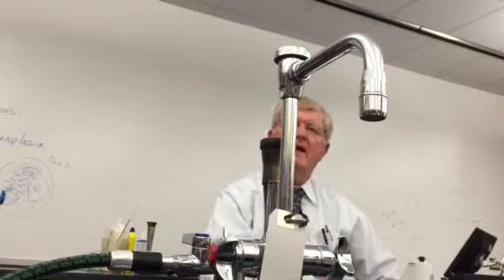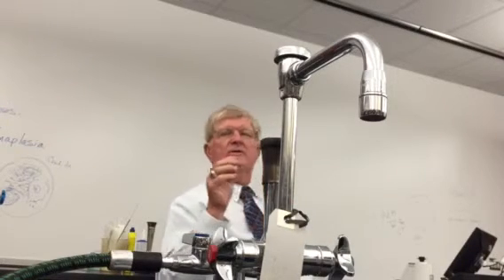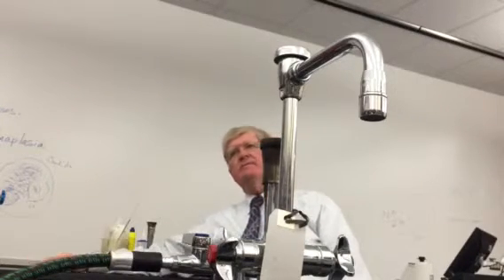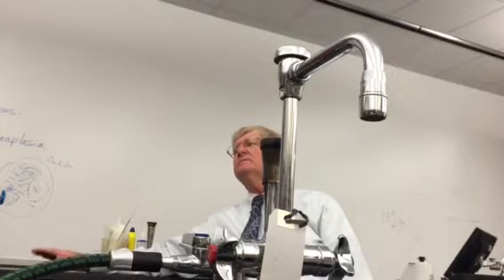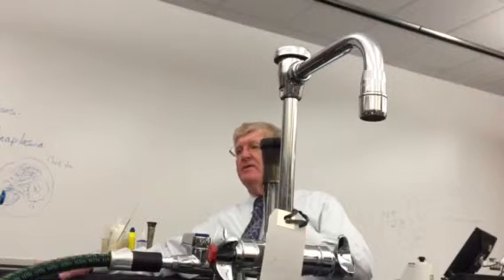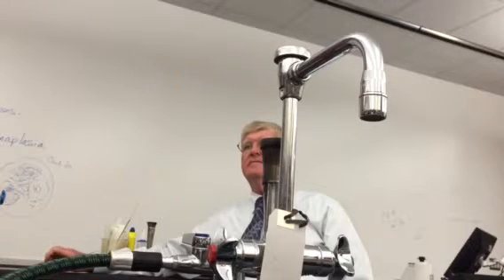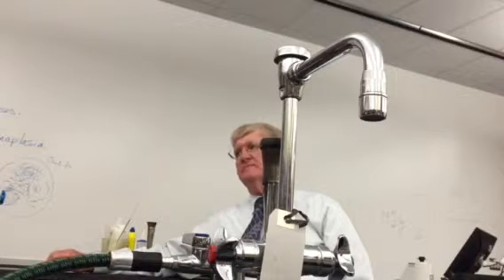Now, what did we have to add to the data we accumulated that told us the rate of acid production? Time. Time was the factor. This is on your handout sheet, the caries susceptibility experiment. Less than 24 hours was high, 48 was medium, and 72 was light. More than 72 was negative. Is that not on your page?